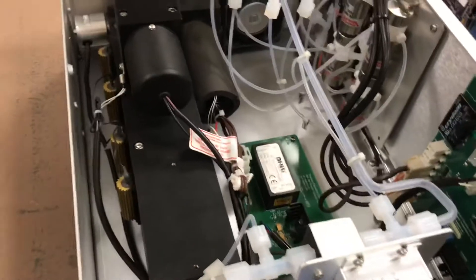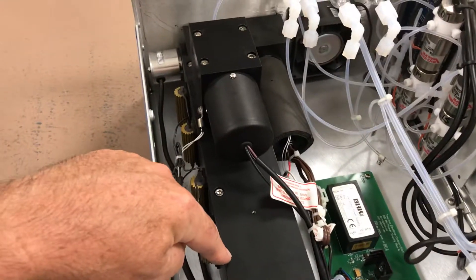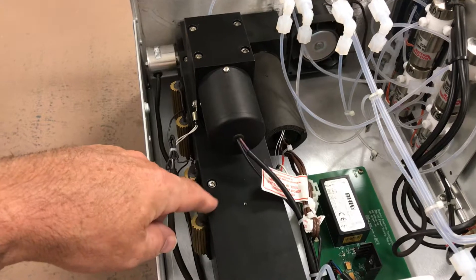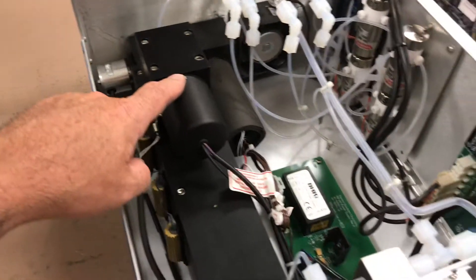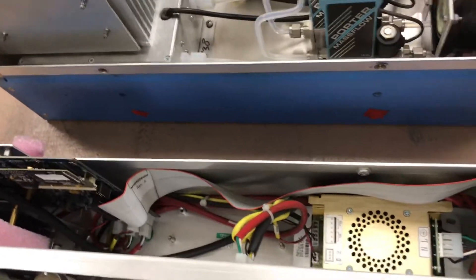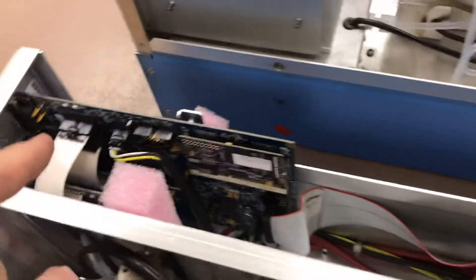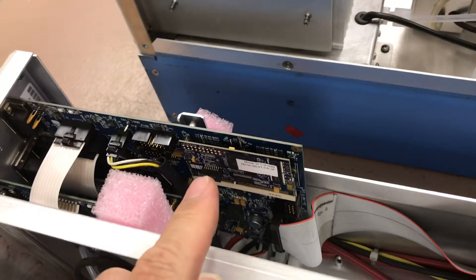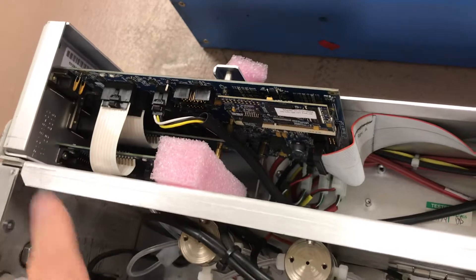Pretty straightforward — it's simply UV light absorption directed into the reaction cell, and any mercury vapor present absorbs UV light, picked up by the photomultiplier tube. On the other side, it's very similar to the typical i-series: there's a DC power supply, a processor board and motherboard, and electronic output boards in the back.